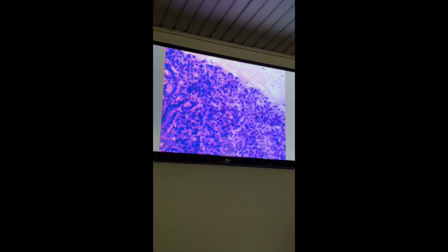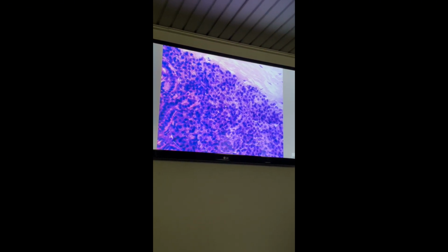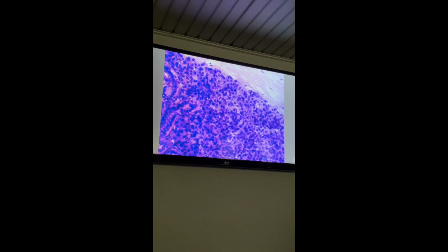Yes, serous acinus. Serous acinus. Serous cells are arranged in a spherical structure surrounding a very small lumen.